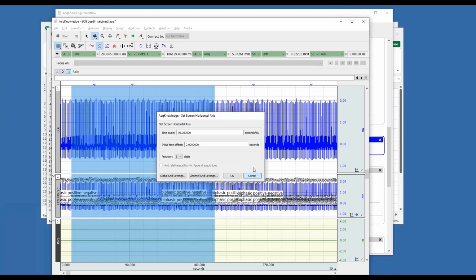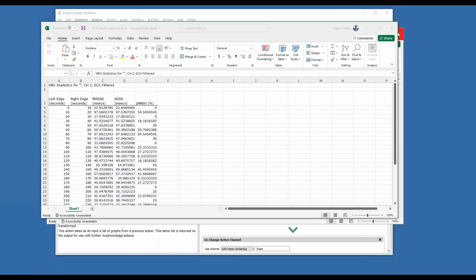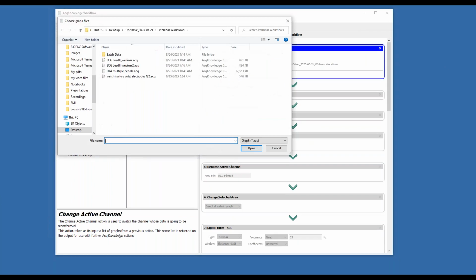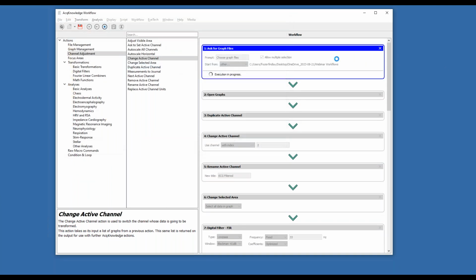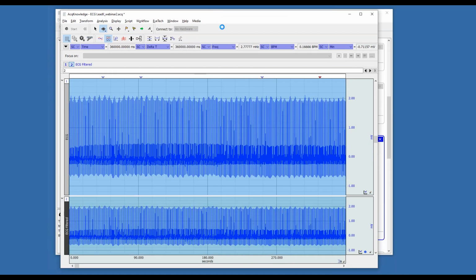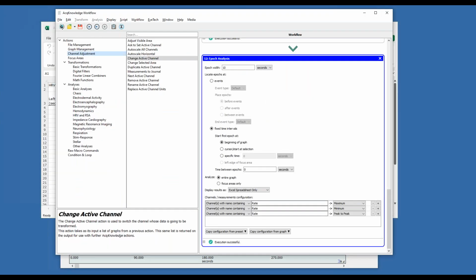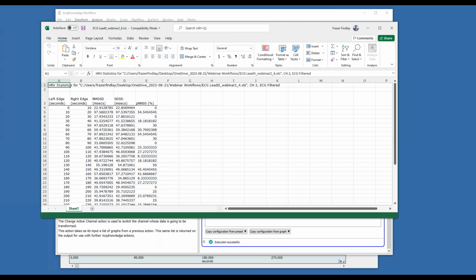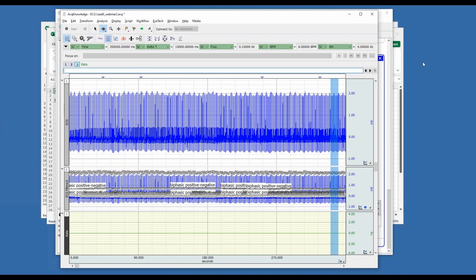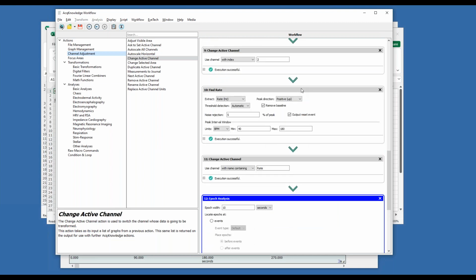I'm going to close this out. We'll just run it one more time. Okay, so I've got something wrong here. Let's have a look. What am I doing wrong? Oh.